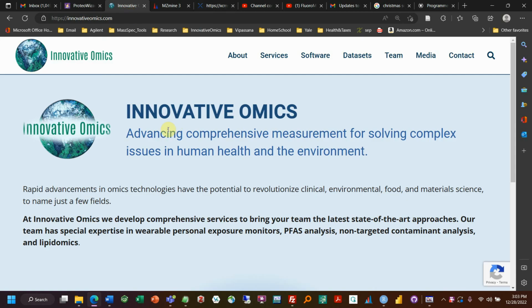There's a lot out there, and peak picking is very challenging. And so if you have an optimal peak picking algorithm, I'd love to hear from you because we're always looking to advance our peak picking algorithms that we integrate with FluoroMatch. So if you have your own peak picking algorithm, which can also include annotation, grouping, and other pieces of evidence that are compiled into one data sheet, you may want to keep that.